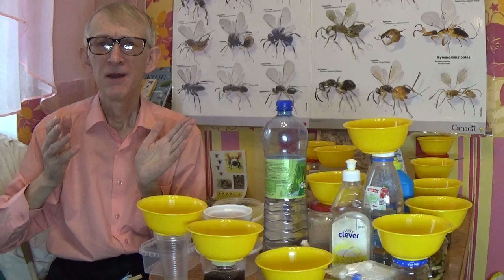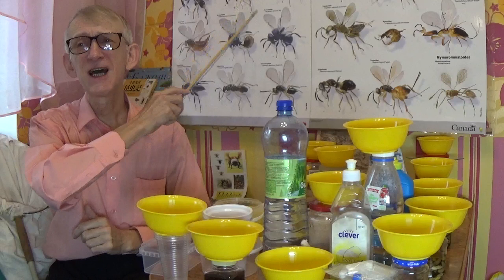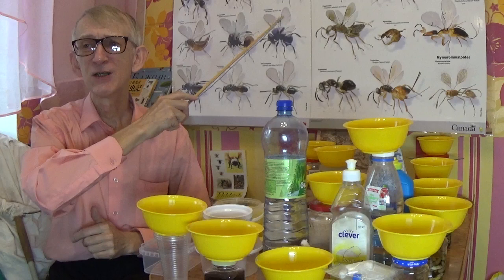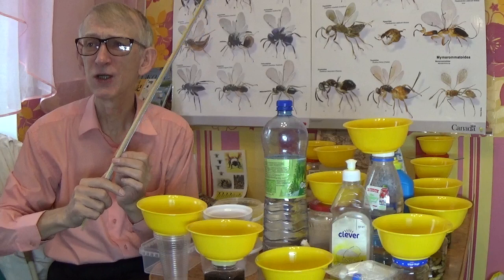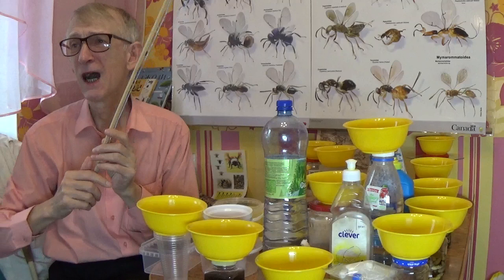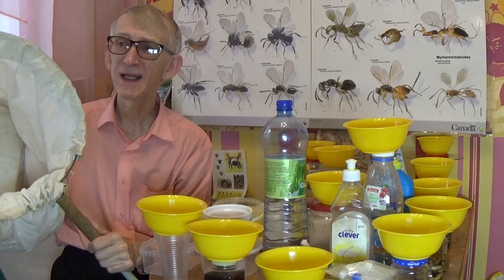These yellow pan traps are very useful for collecting different types of insects, but especially for collecting tiny parasitic wasps of the superfamily Chalcidoidea — particularly tiny Trichogrammatidae, tiny Mymaridae and others — which are very small, less than 1 mm, 0.5 mm and even less. Others like Chalcidoidea can be bigger, up to 5 mm.